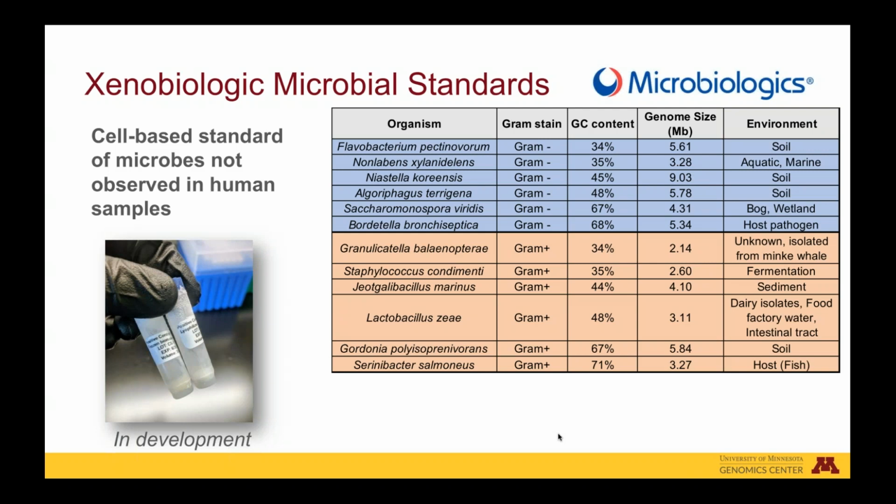Now, in order to use our community as a control, we need to be sure that the organisms in this assemblage are well characterized. And while 16S sequences and reference genomes for these species or very close relatives exist in public databases, they're not necessarily for the exact strain we've used in our assemblage. And in the case of reference genomes, many of them are highly fragmented because they're built from short-read data. And so, in addition to all of that, we're also concerned that potentially the 16S copy number that's estimated in available databases could be incorrect, partially due to this genome fragmentation.